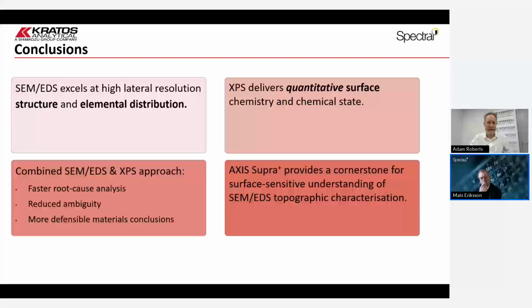I think so. There's another question from a good friend of mine, Matt. He asked about particle sizes that he is often looking at, where the particles are hundreds to thousands of nanometers. They're not really nanoparticles, or really films, but somewhere in between, often too small for XPS imaging.